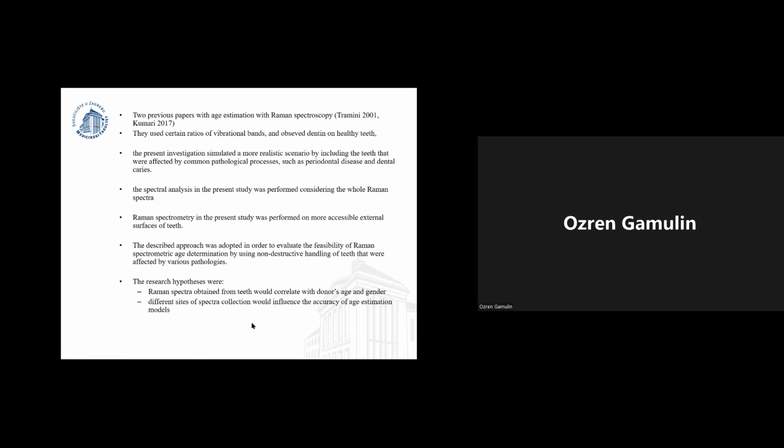The research hypotheses were that Raman spectra obtained from the teeth would correlate with the donor age and gender, and that different collection sites of Raman spectra would influence the accuracy of the age estimation models.